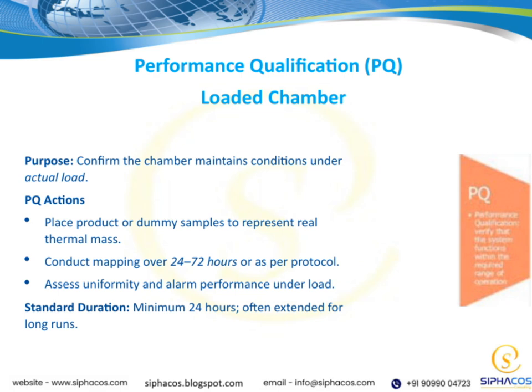When we conduct the PQ actions, we start by placing either actual product or dummy samples that mimic the thermal mass of real items. This helps us replicate the true load conditions. Then, we perform mapping over a period of 24 to 72 hours, or as specified by the protocol. This duration allows us to thoroughly assess the chamber's performance across different conditions and times.